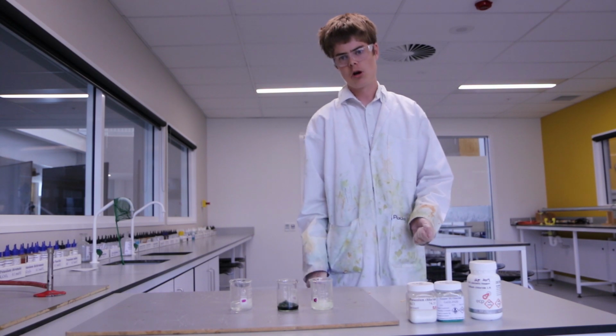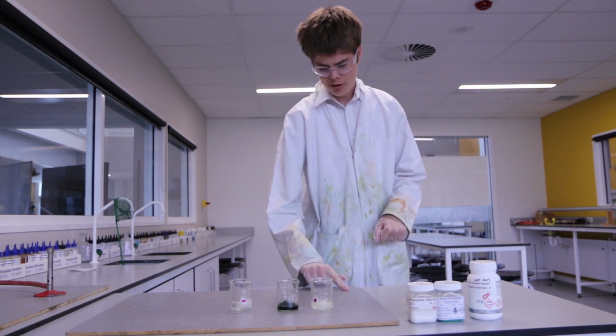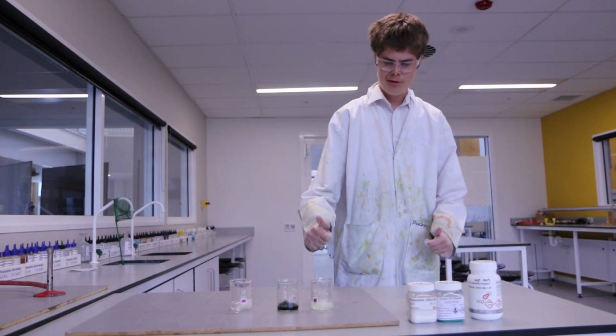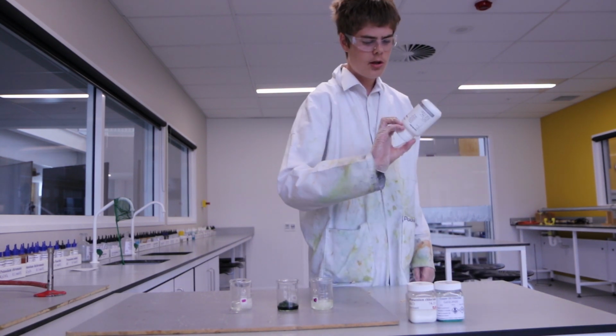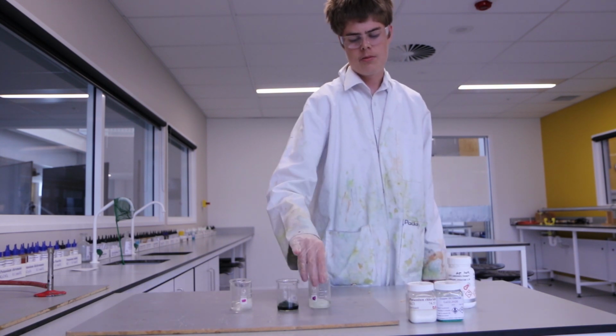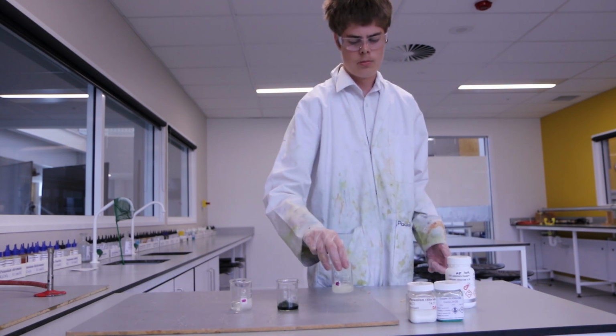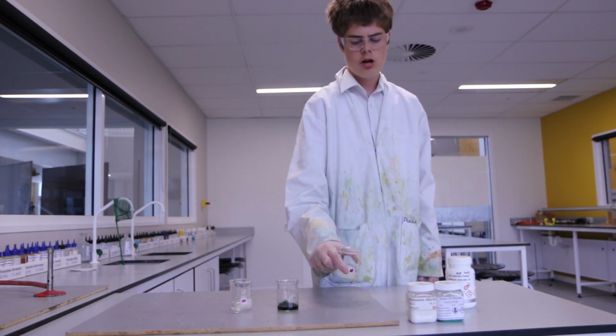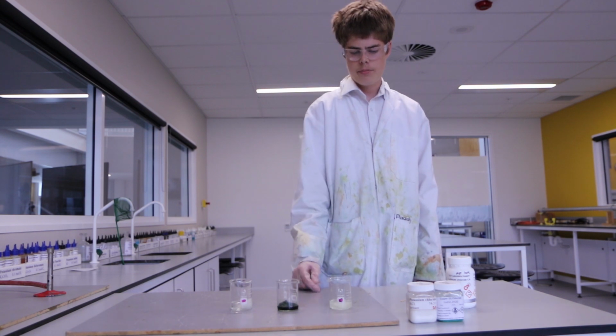Okay, this is Flaming Colours, where we burn dangerous chemicals and see what colours they make for your entertainment. Hooray. Okay, so this is lithium chloride dissolved into a solution. Generally, it burns red when put into a flame.